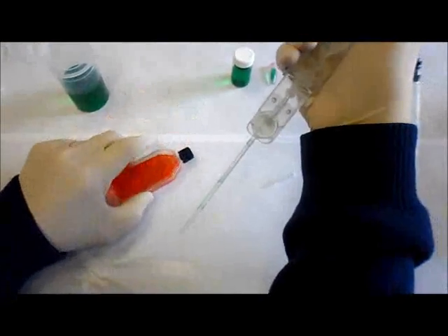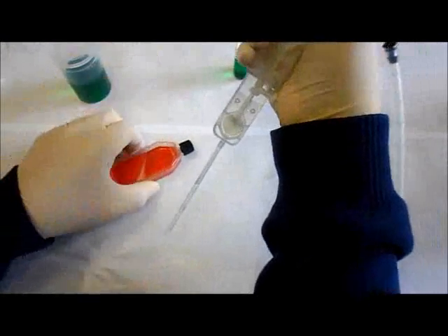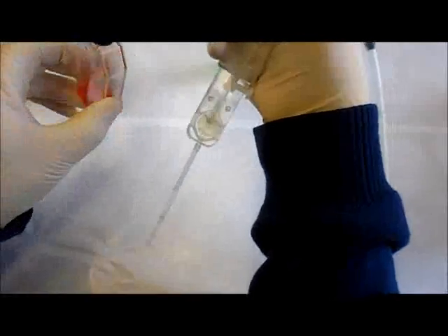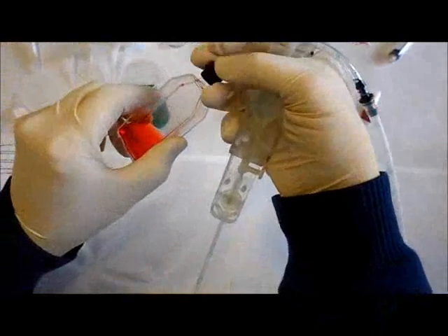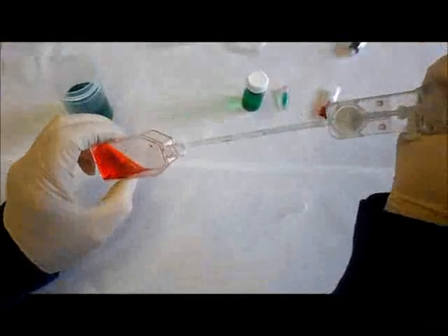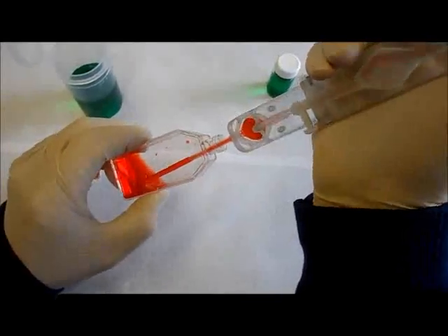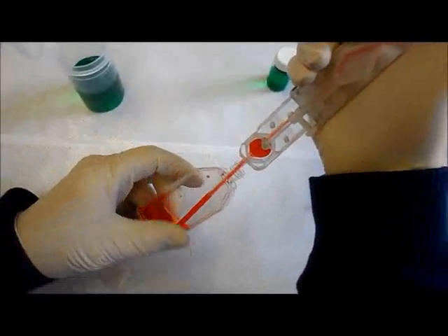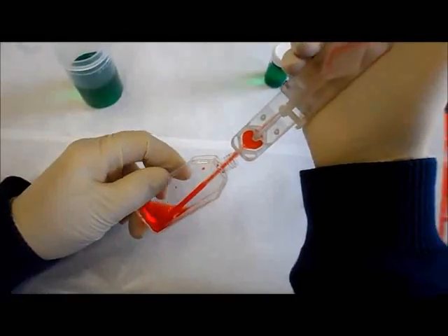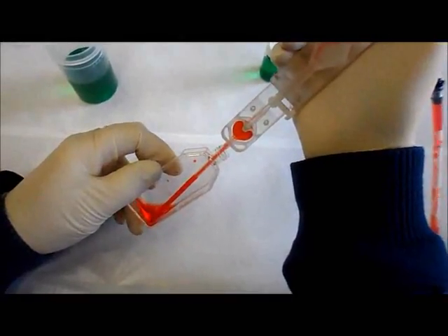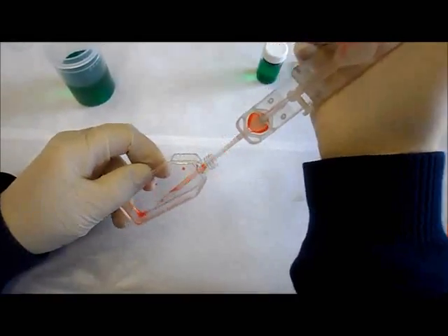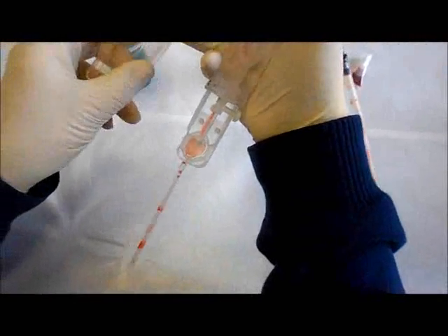I'm going to show here is another example with an extension tube on like this. If we had a fluid, for instance, in a culture flask, we can reach down into the culture flask and pull up the sample fluid and you can see right there how the red rushed right into the sample and quickly filters this fluid. So that process is done.